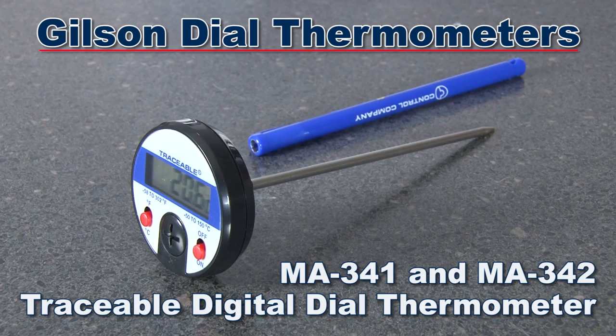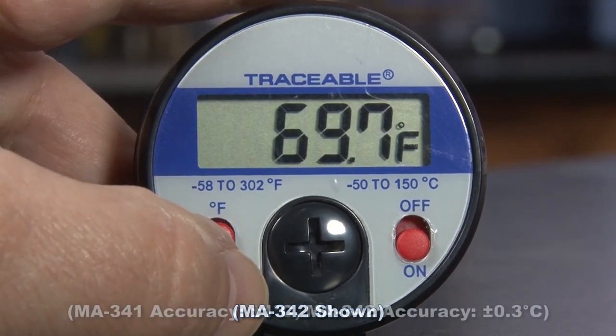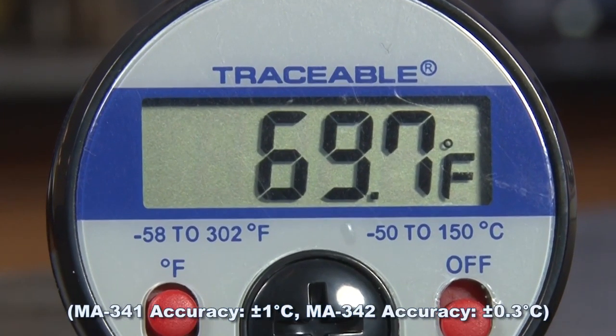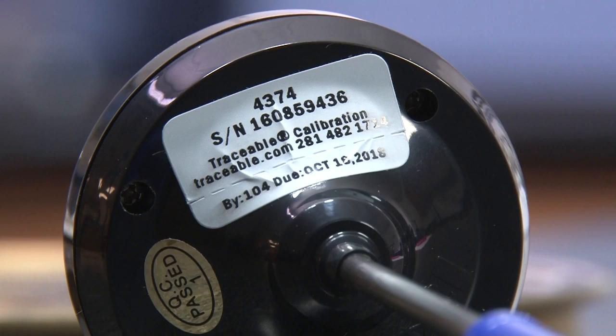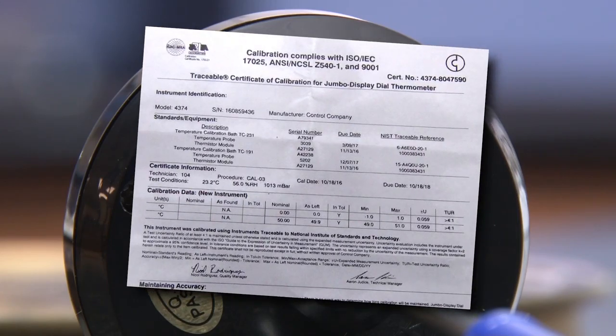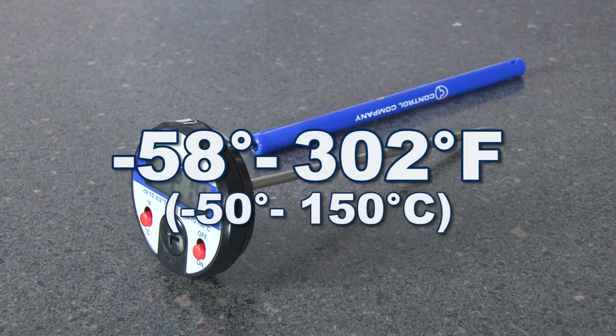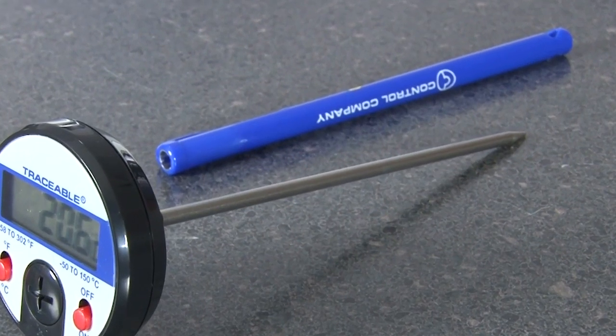The Gilson MA341 and MA342 traceable digital dial thermometers are switchable between Fahrenheit and Celsius. The extra large LCD display is easy to read, and each unit is serial numbered with a NIST traceable certificate from an accredited laboratory. These units have a temperature range from minus 58 degrees to 302 degrees Fahrenheit and come with a convenient pocket sleeve.